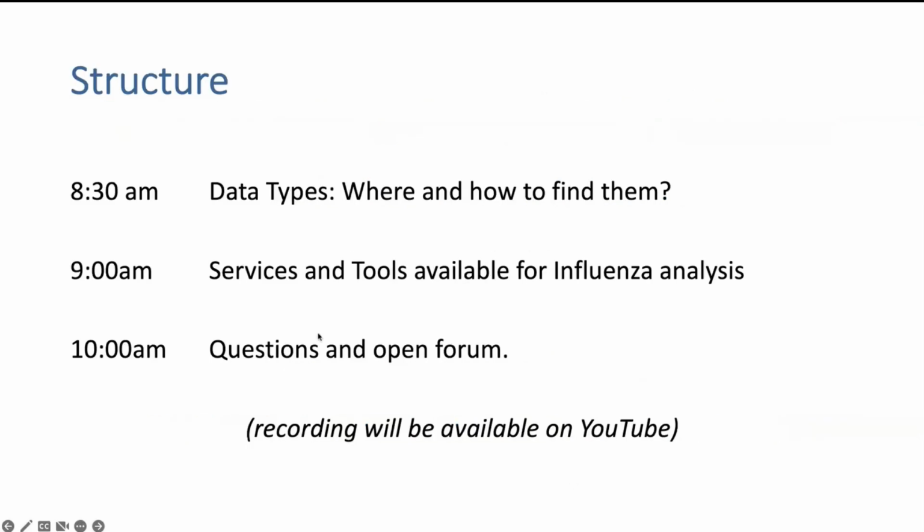We'll start off with talking about the different data types that are available in the BV-BRC, whether it's genomes, proteins, or other types of data. Then we'll move on to the services and tools that you can use to analyze this bioinformatic data on influenza. And then we'll take some time for questions and just have an open forum, and we can walk through how to do things if people have specific questions.